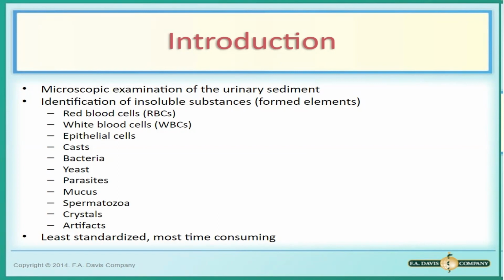Okay, does the presence of formed elements outrightly signify disease conditions? The answer would be no. As I have mentioned, di ba, meron tayong pathological causes ng turbidity. One of the listed there is RBC, WBC. Pero not necessarily if you see an RBC or WBC, pathologic agad or clinically significant agad. Hindi po. Meron tayong mga different factors pa na tinitignan for us to say na may sakit talaga si patient.